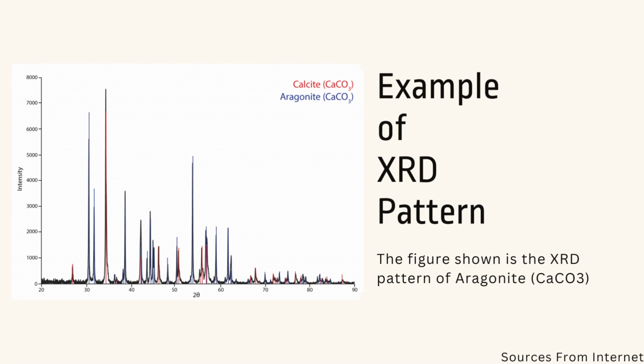Before the end, let's look at the example of XRD pattern. The figure shown is the XRD pattern of aragonite.